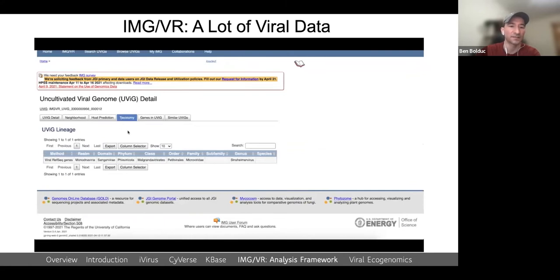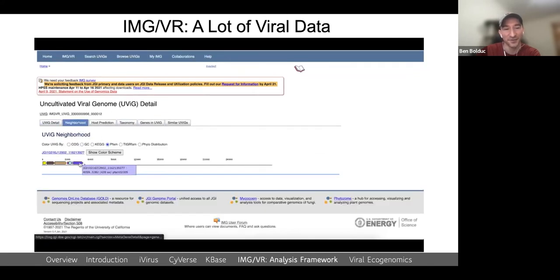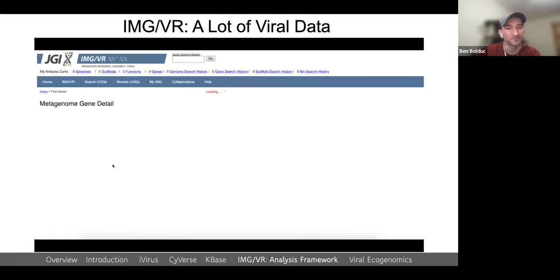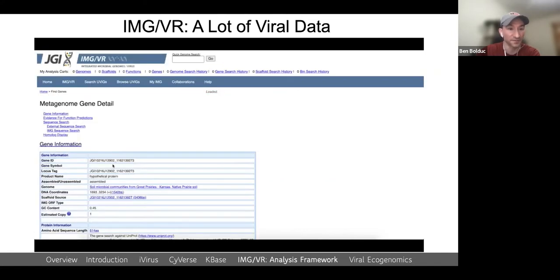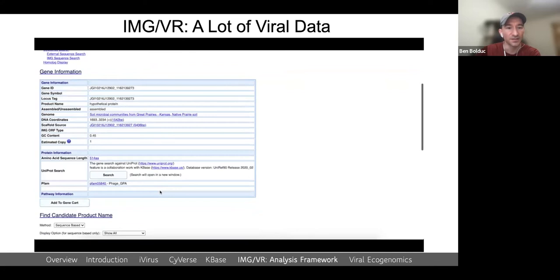And these are all the different aspects that we were looking through earlier. As I said, they've already done all of these analyses. So you can look through the genome annotations for each of them based on KEGG or COG or PFAM, TIGRFAM, et cetera. I don't know if I click on them, but you can look through the different genes. It's a hypothetical protein. You can search through and filter for other genomes that might have that same gene.